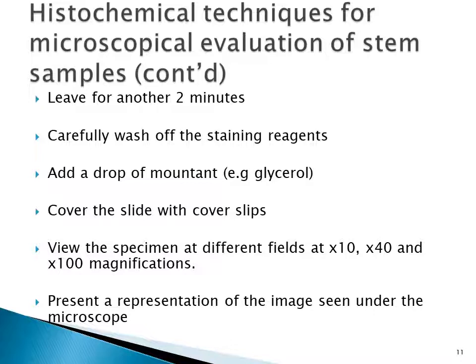And when you're covering with cover slips, take care that you don't allow bubbles to be formed on your slide, because by the time you start viewing under the microscope, you will just be seeing bubbles. So please take care when you are covering your samples with the cover slip not to trap some air on your slide.